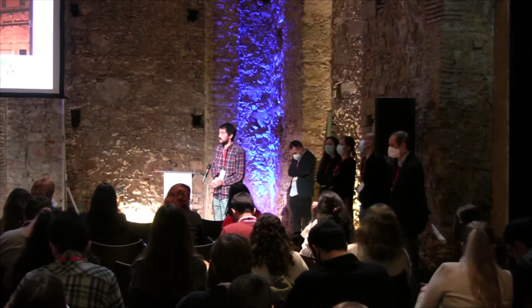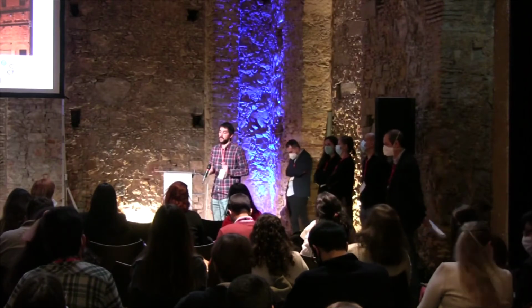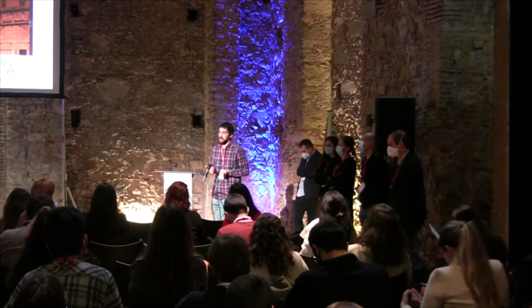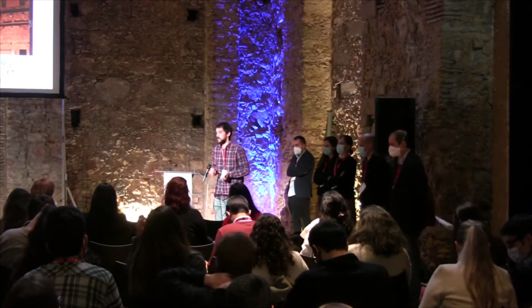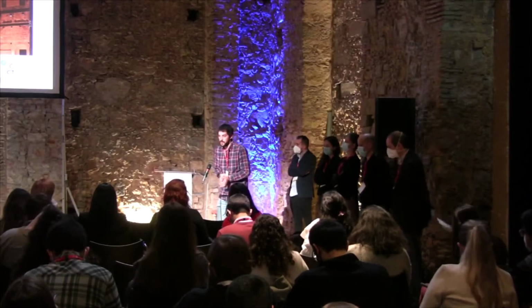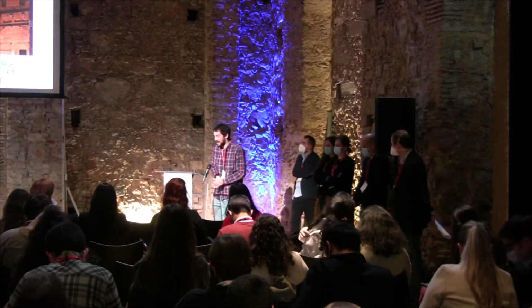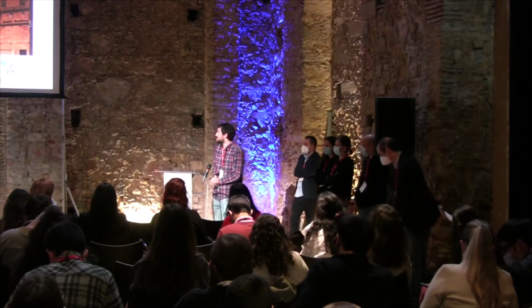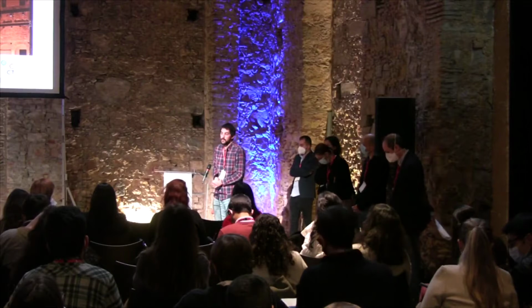We hoped that it would even help in the process of concentrating the protein in order to do some crystallization trials, but the yields were very poor. So we had tons of nanobodies to work with, but not enough protein to do crystals. But they do work.